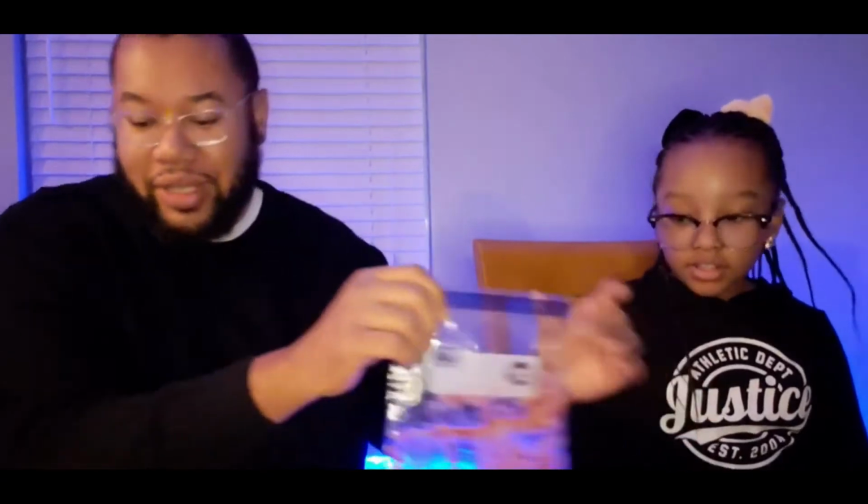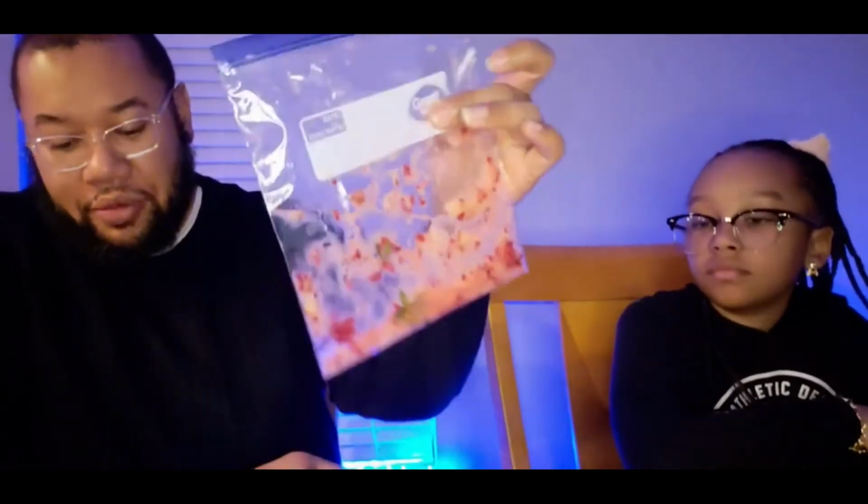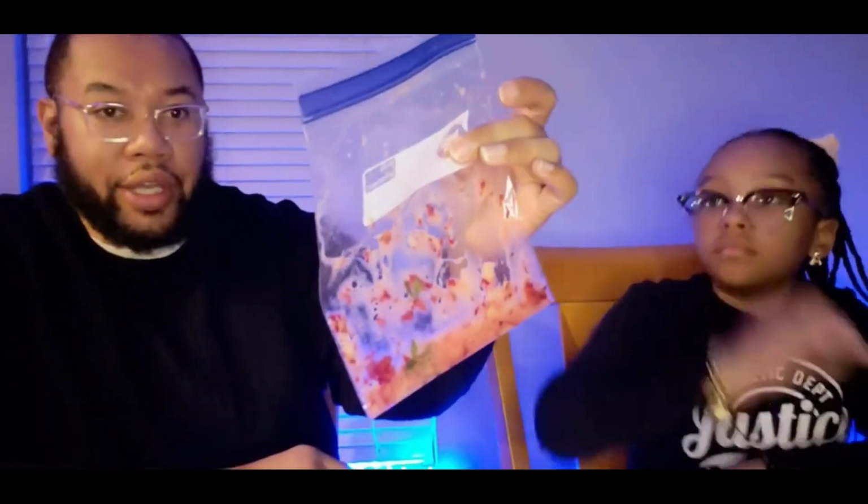Playing the drums here, we'll go ahead and move to the next step. Okay. So, the next step is that we're going to filter this DNA by taking some of those filters. I said it looked like a coffee filter. We're going to put it over top of that other small cup that we have and put a rubber band up over it so we can create this filter system.